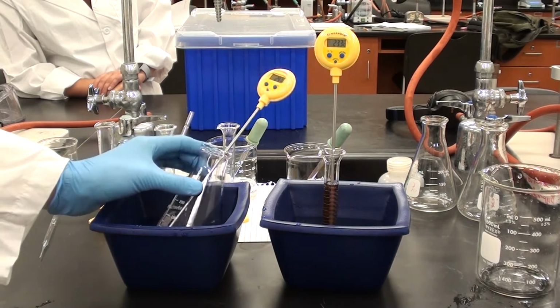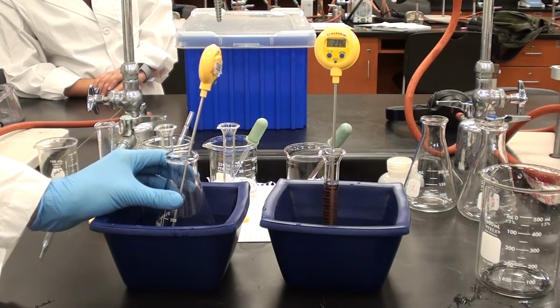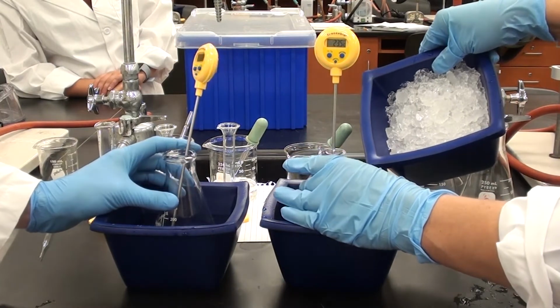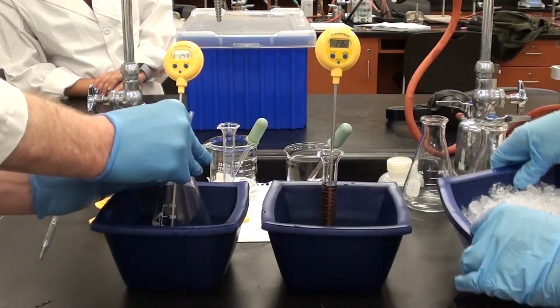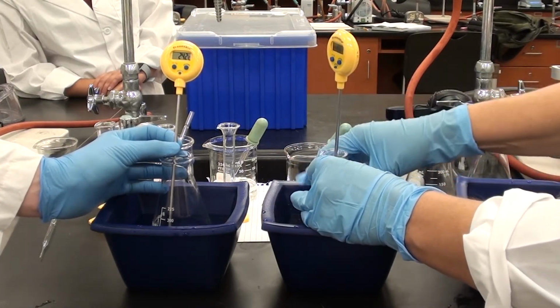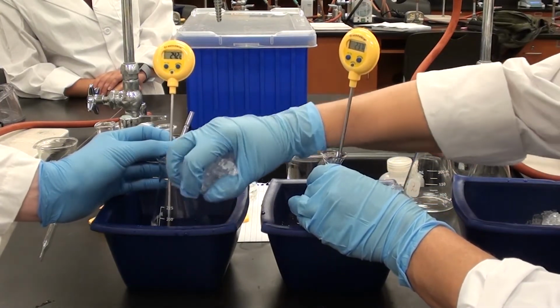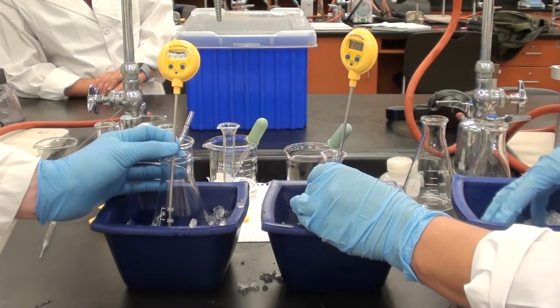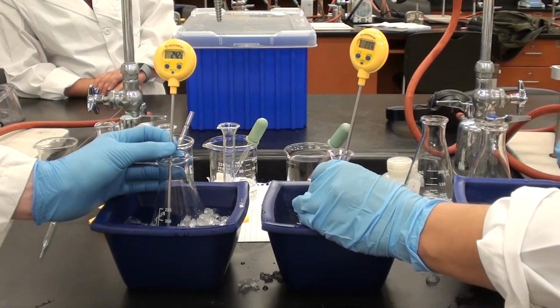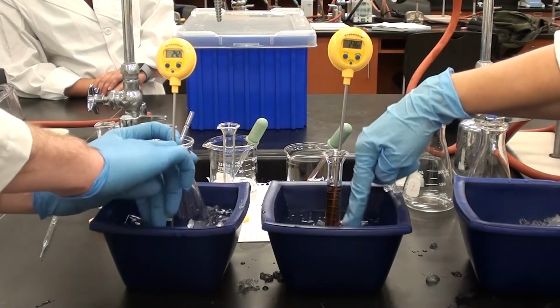Now you're going to have to hold that. Now what you're going to do is add ice to each of those so we can get the temperatures down. Would you please use your hands, Julie. Thank you. Okay, that'll do. And on the other one, do the same, please. Now you'll notice the iodine is in a separate container, so it's a smaller container. It's going to cool quicker. Alright, I think that'll do it. Now give that a bit of a swirl around, Jeff. Julie, yours is fine.